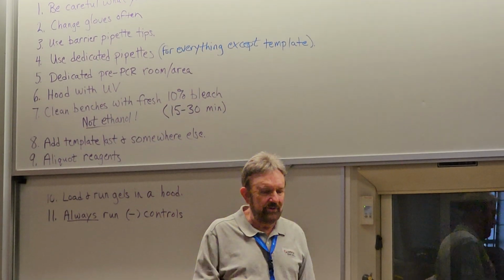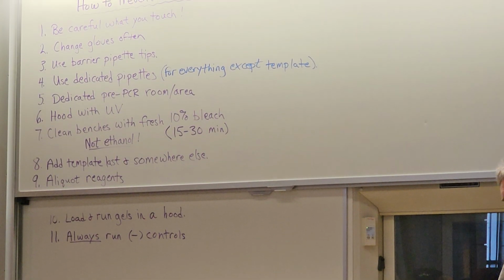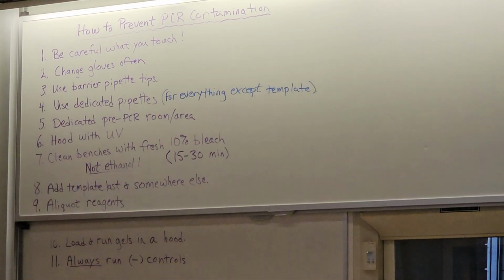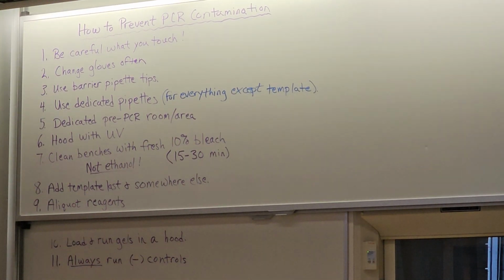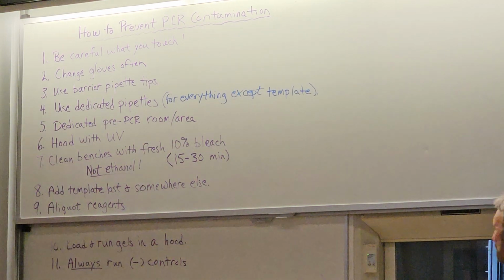What's the main concern when you're worried about contaminating your lab? I said if my lab works on PCR, it's going to be contaminated with PCR. But you'd like to keep that to a minimum. You're not going to be able to prevent it completely, but you can tamp it down. You can keep it to a minimum.